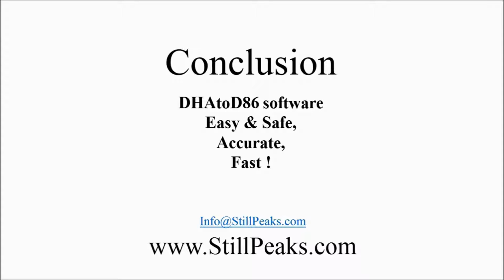We talked you through our latest StillPeaks DHAtoD86 tool, which is easy, safe, accurate and fast.